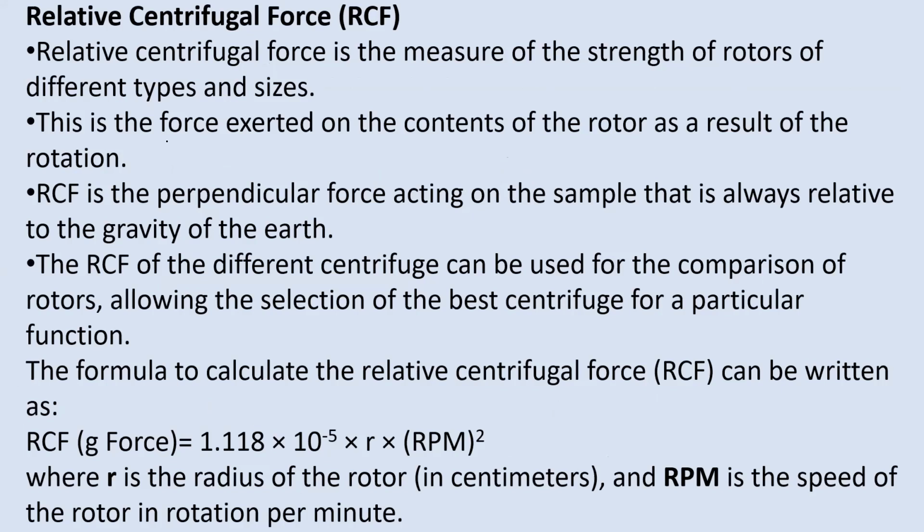The force exerted on the contents of the rotor as a result of the rotation. So RCF, or centrifugal force, is a force that is exerted on the contents of the rotor as a result of the rotation. Whatever content you are going to keep in there, the centrifuge tubes, they are special tubes. They are not glass tubes. They are made up of durable matter, because if it has to rotate at such a high speed, it should not deform, it should not crack, it should be able to sustain that force. That kind of material is very close to plastic, but it is a high quality material.